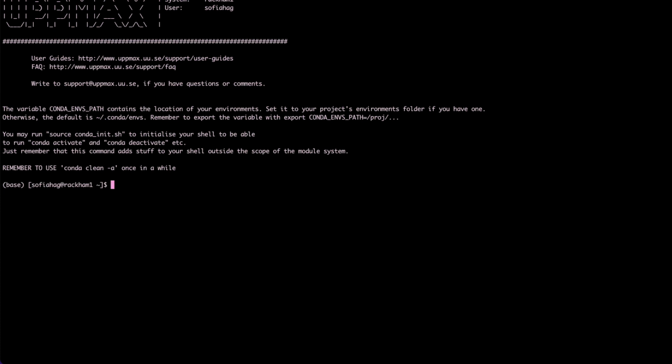Okay, now I will download the project content. And also verify the checksum. Let's call it the same, this folder.